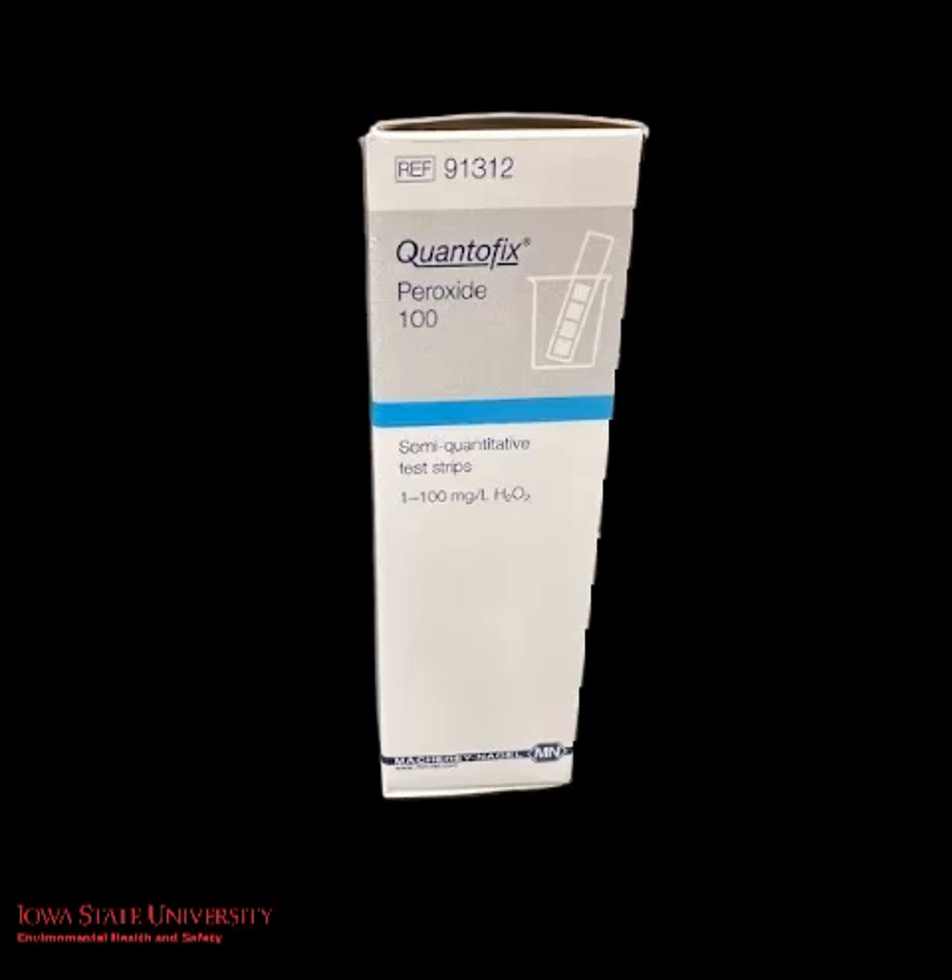In this video we're going to use Quantofix dip strips to test an organic solution for the presence of peroxides.